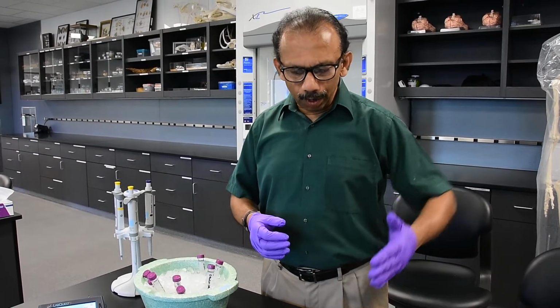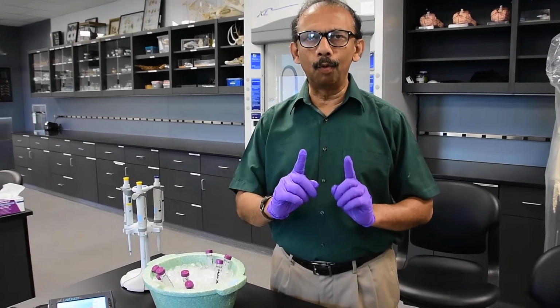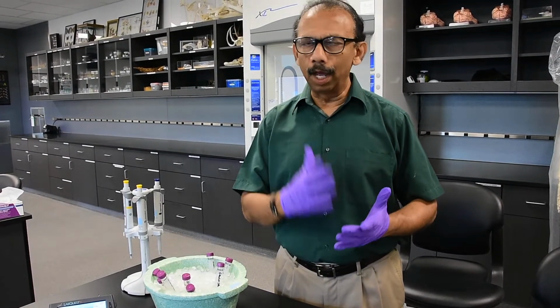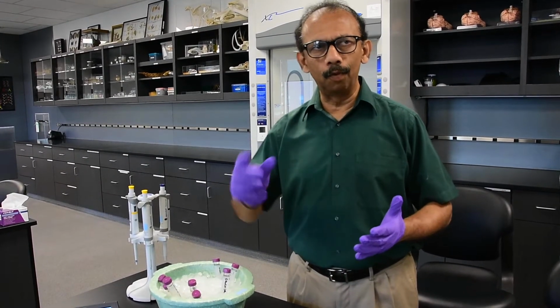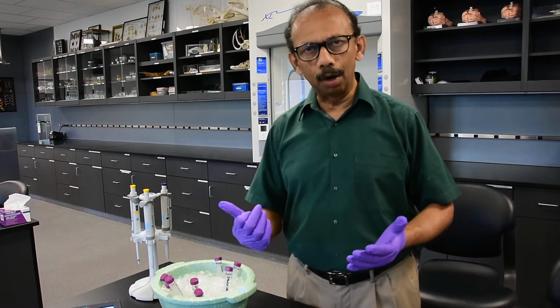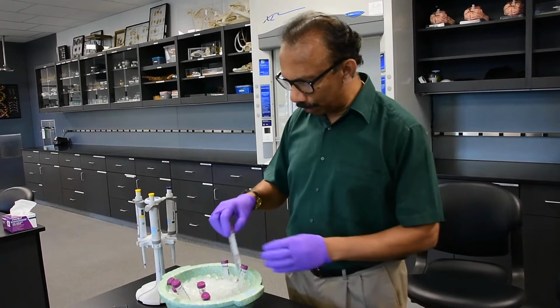But we are doing a serial dilution. In this case, you add the stock only once to the first cuvette, then you add water to each one of the other cuvettes, mix and move, and then discard the rest. Okay, that is what I'm going to show you, how to do serial dilution.